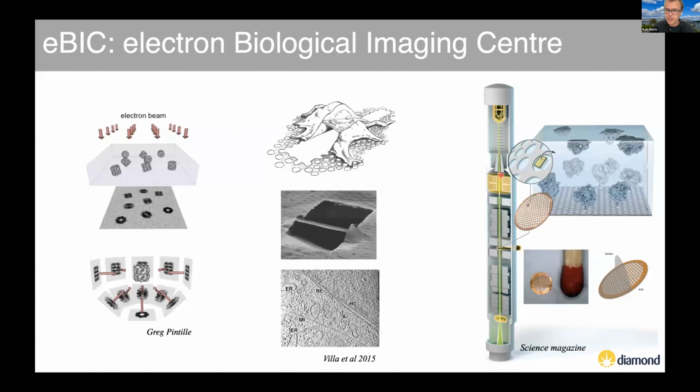So this is an electron microscope, something you've heard about already in the previous talk, which was excellent. A facility covering lots of different imaging techniques, but we exclusively run electron microscopes. Our samples are on a little grid right inside here, and the molecules are in ice, and we shine our electron beam through them, and there's a camera down here.